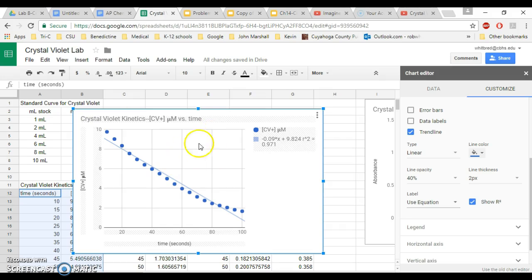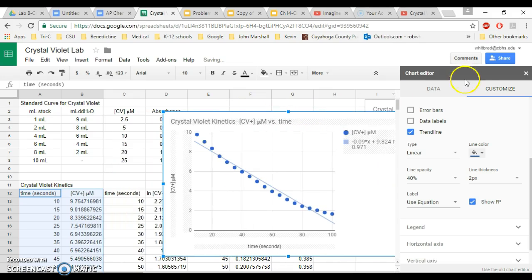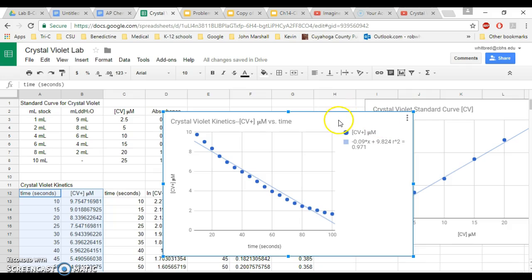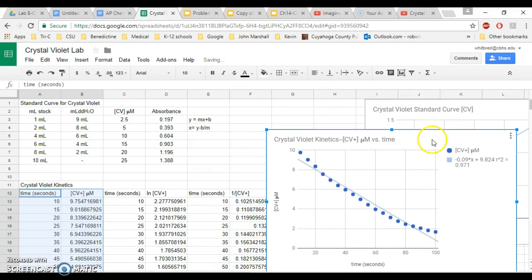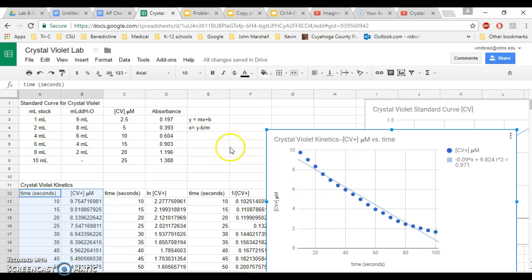You're going to do this exact same process three times. You're going to use three different data sets. So this is the first data set, and then you're going to do time versus log and you're going to do time versus one over CV. And each one of these graphs, I want you to plot a linear trend line, include the equation and include the R squared. After you've done all three of them, you can then put all three of these, insert all three of these into your lab report.